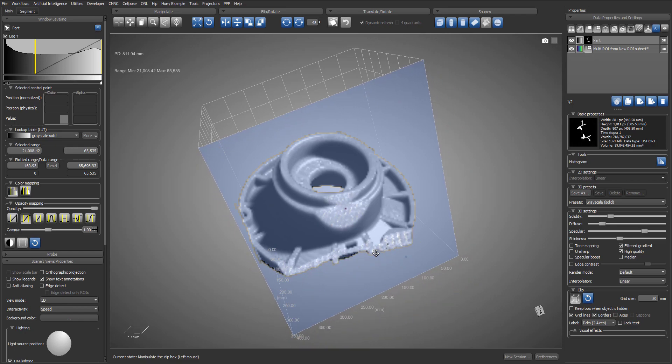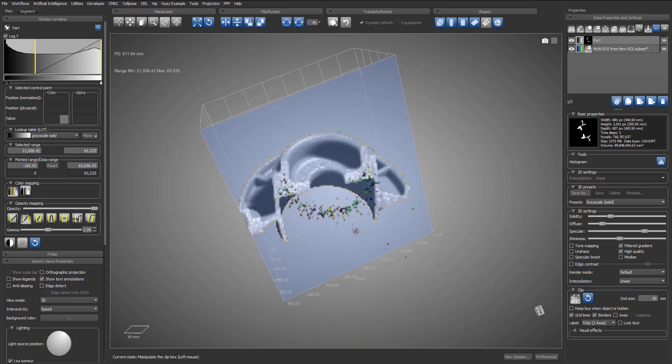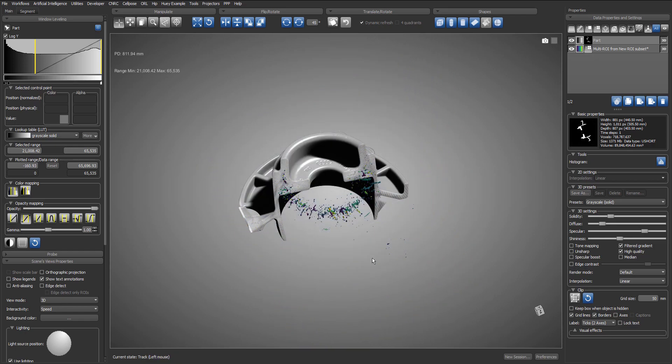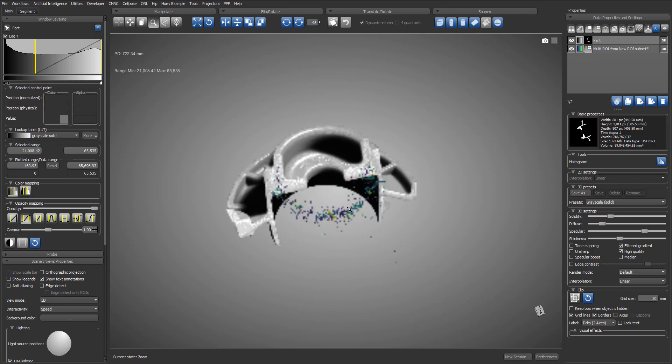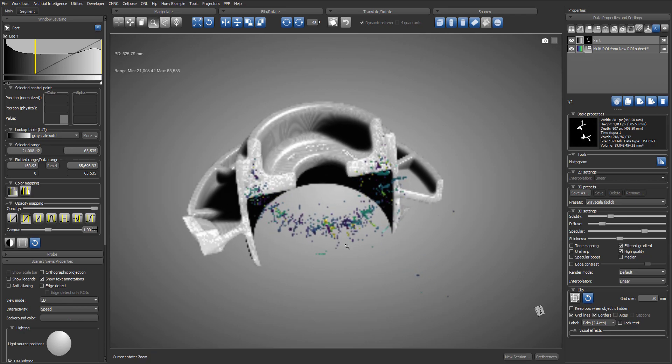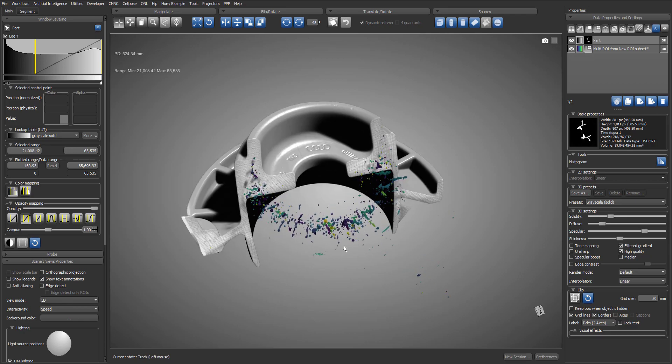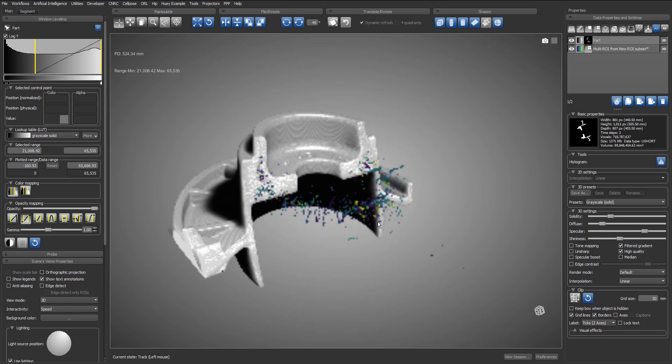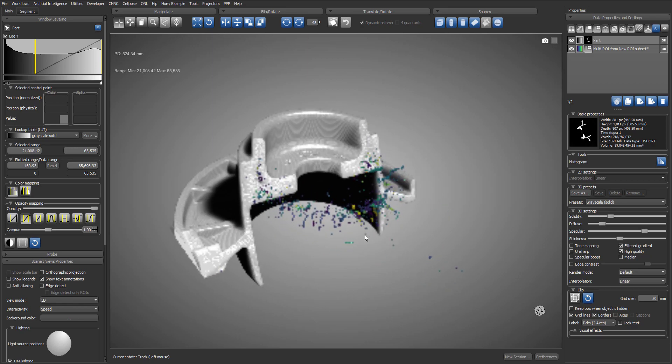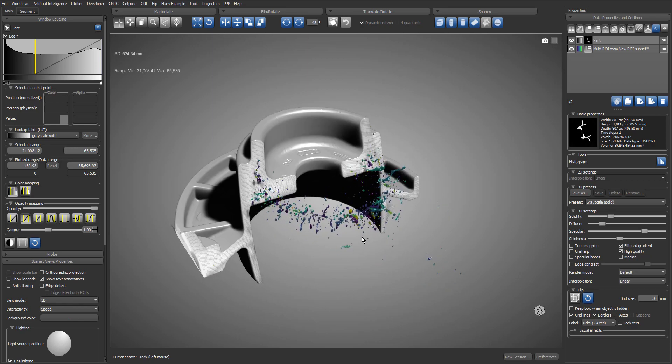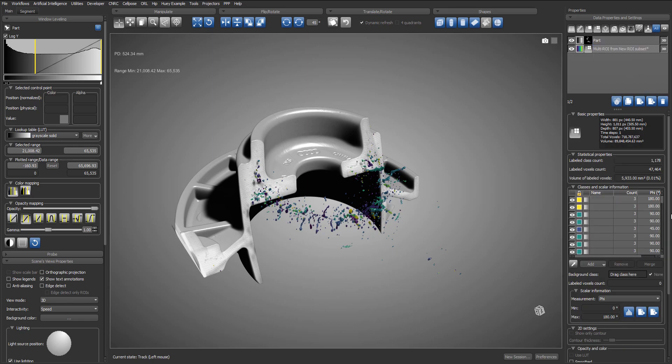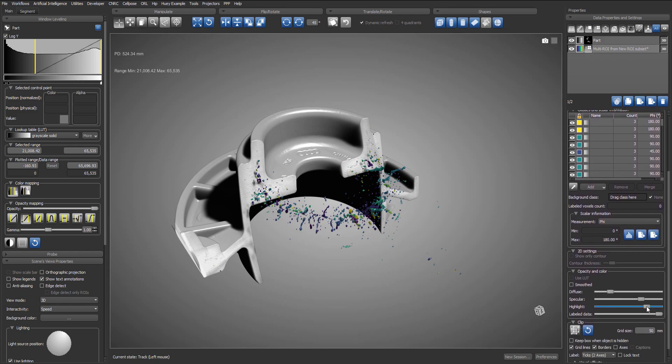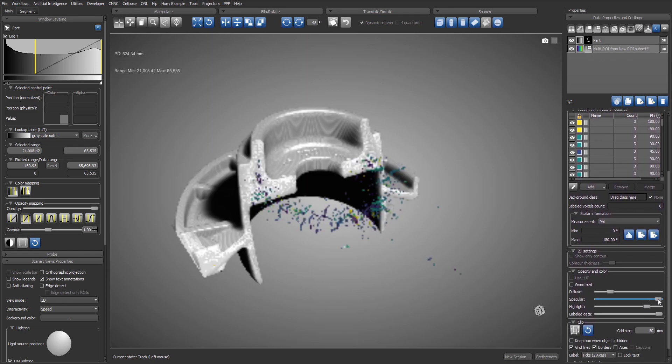If we clip inside the dataset, I can see the multi-ROI lying inside. I will then select the multi-ROI object in the list in order to show its properties. Then scrolling down, I can adjust the diffuse and specular values by using the sliders.